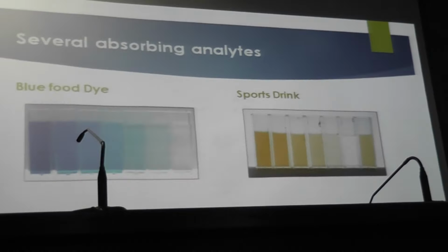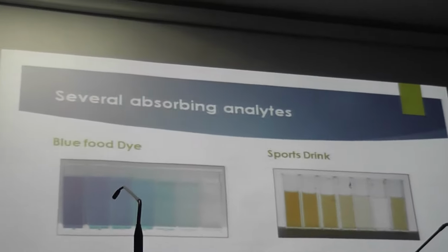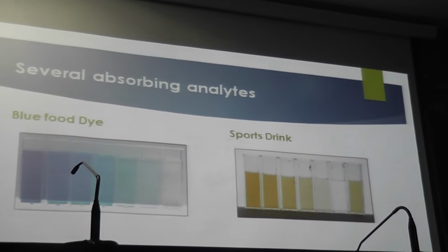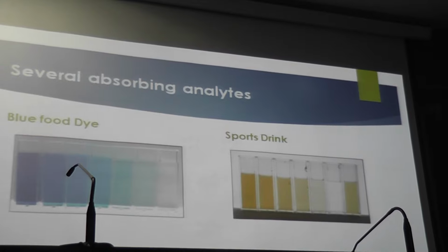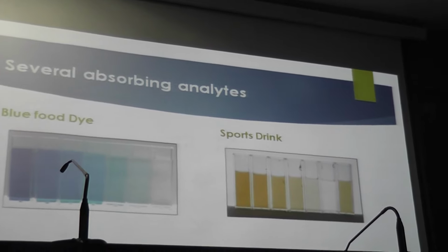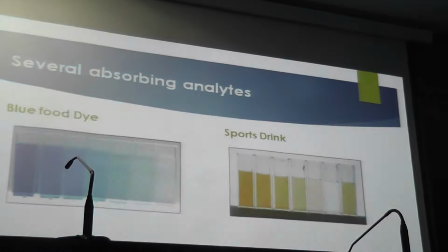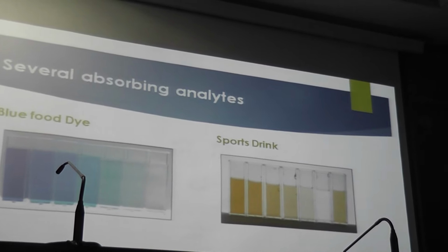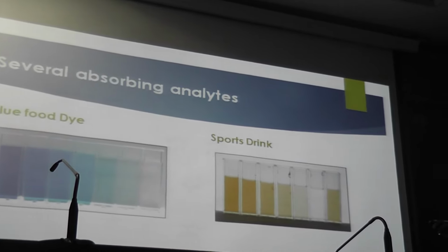This paper was published in 2003 in Journal of Chemical Education. One such paper is also published in our lab, but the work is different. We have synthesized gold nanoparticles. They have used other absorbing analytes. They have done the analysis of blue food dye and sports drink. They took Gatorade powder and performed this experiment.